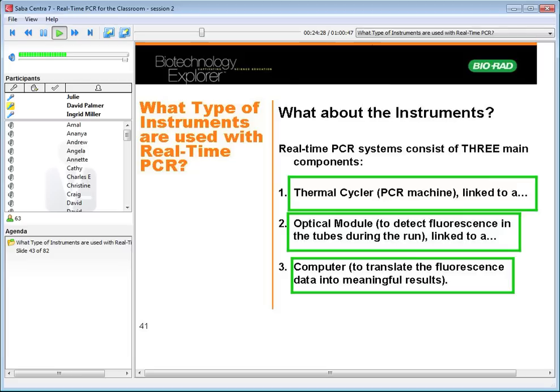Our dilution series may be messed up. If there's pipetting errors, we may have the curves coming too close together or too far apart. There may be too much DNA, there may be PCR inhibitors, maybe even too little DNA, or the PCR reaction just isn't that efficient.